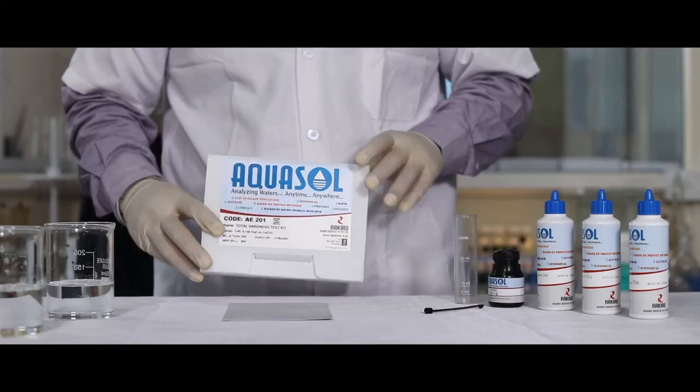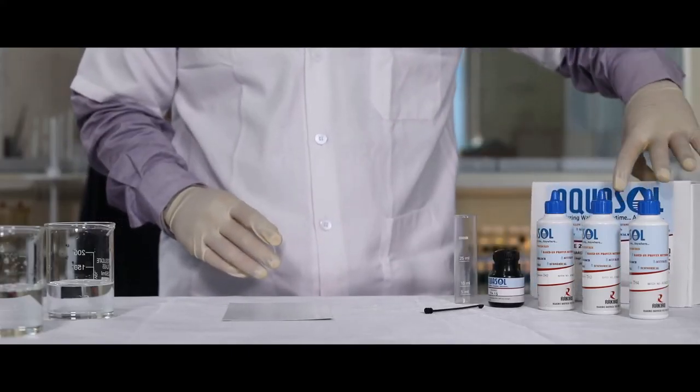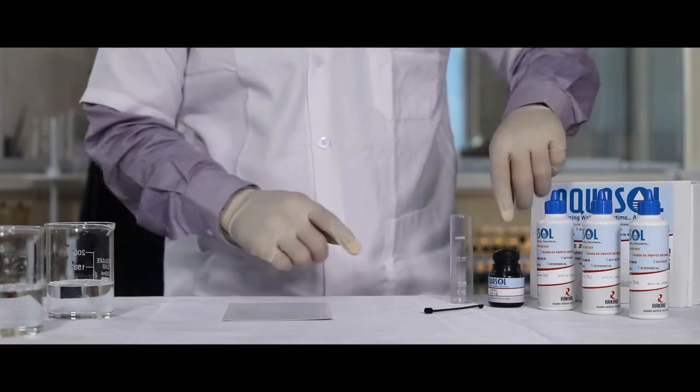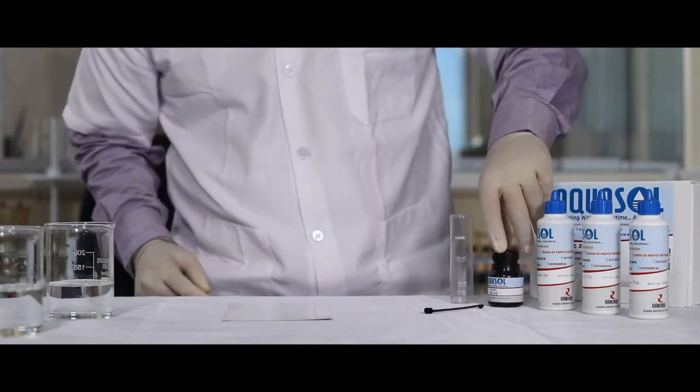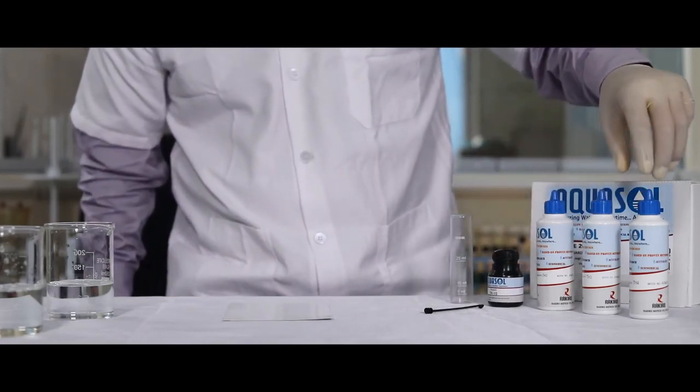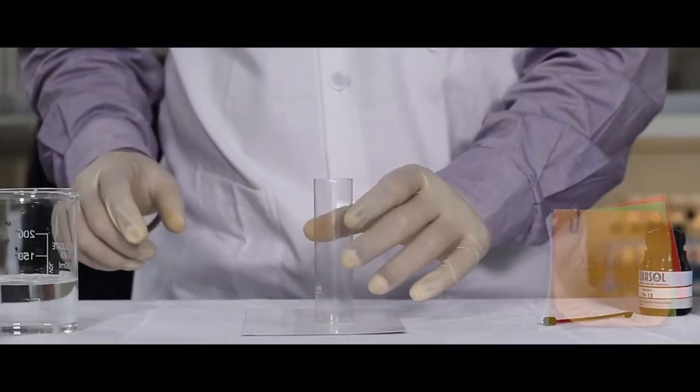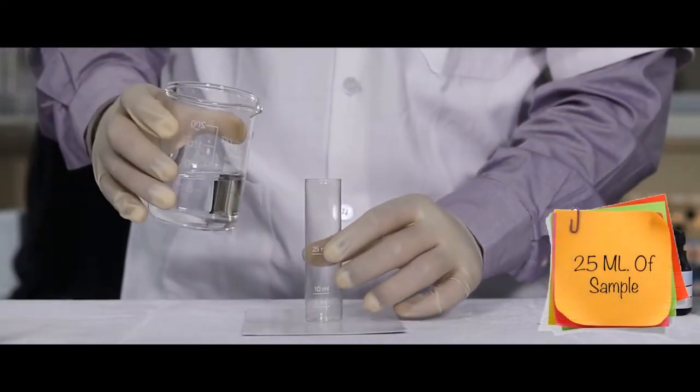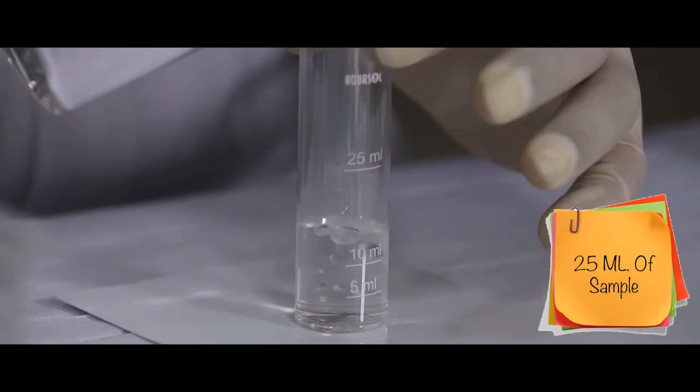This kit is used to check the hardness of the water. The kit contains a test jar, TH1S, TH2, TH3, and TH4. Now take the test jar and fill the sample up to the 25ml mark.